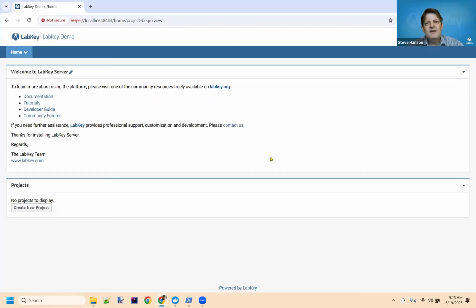So that's really it. I hope that really gives you a sense of how powerful this installation is and how much you can get out of this. I can now start working with data. I can start building out my projects. And again, I think a great sequel for this video right now is to look at my YouTube videos about becoming an admin, a power admin inside the server, and learning all the different buttons and levers that are in this software, which are vast.